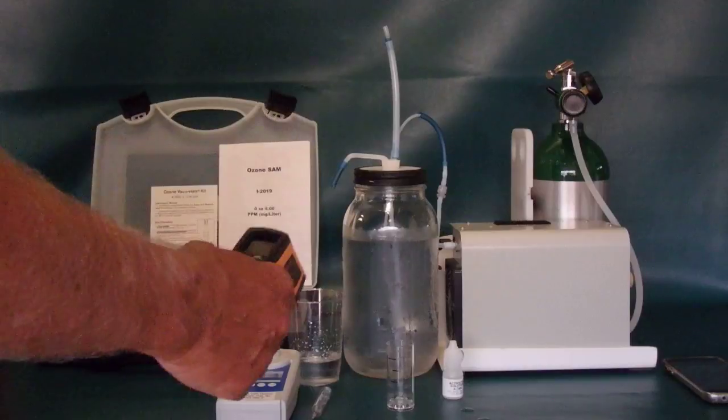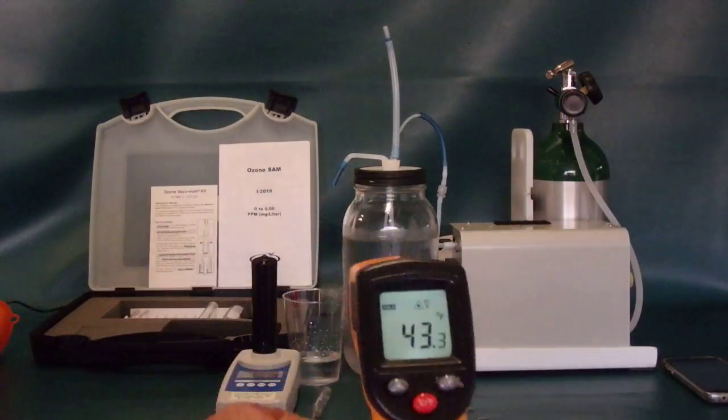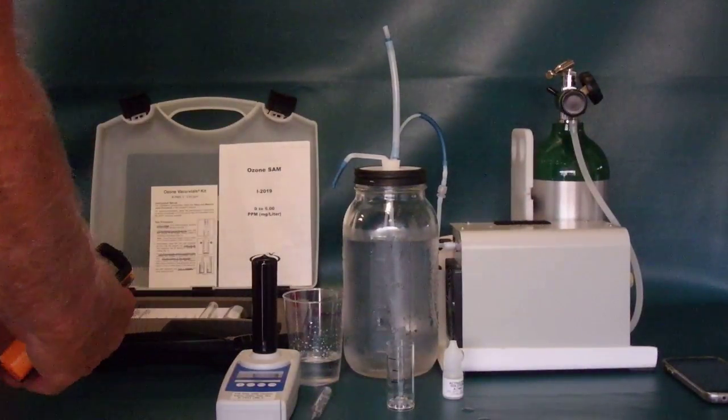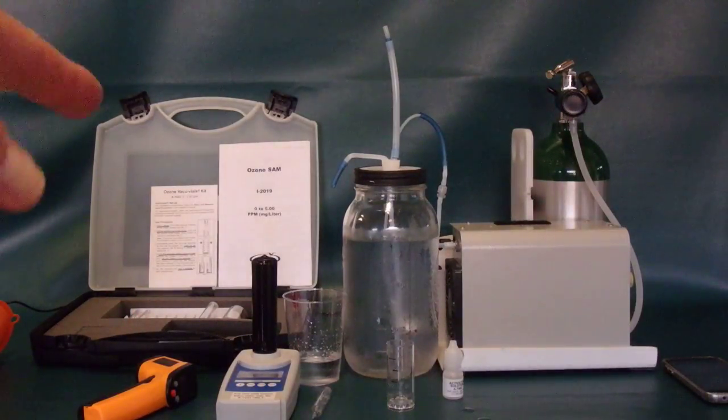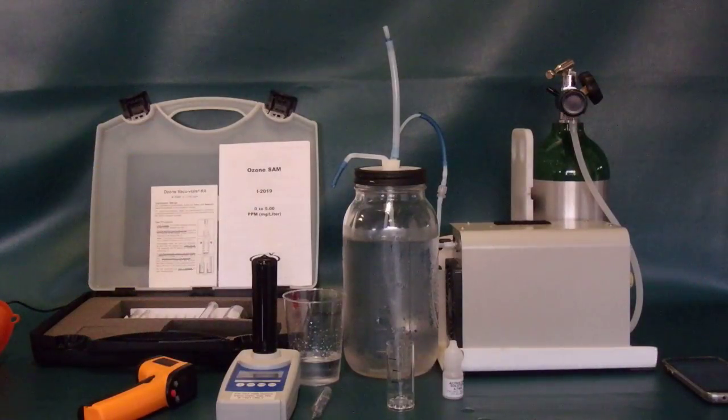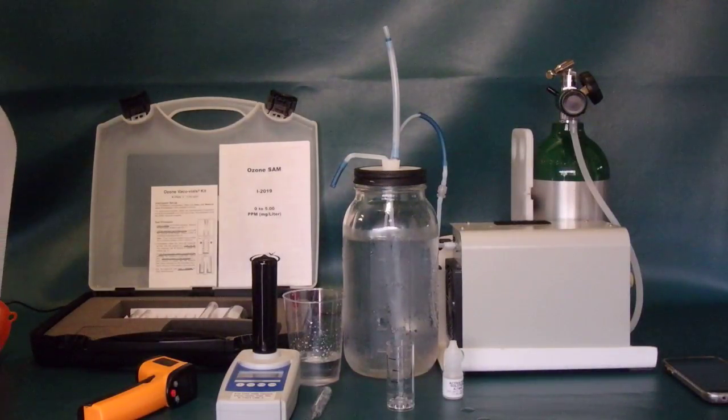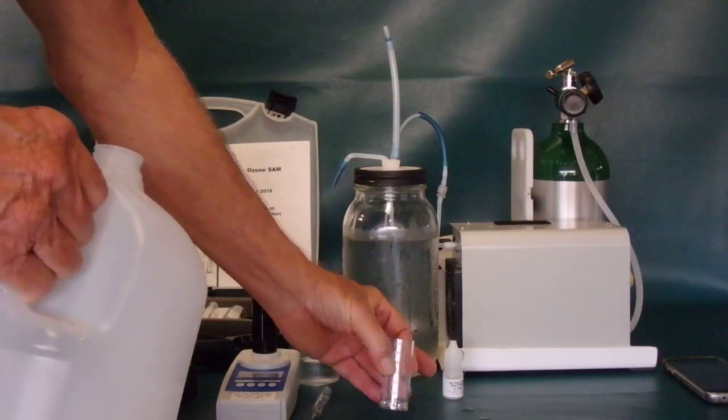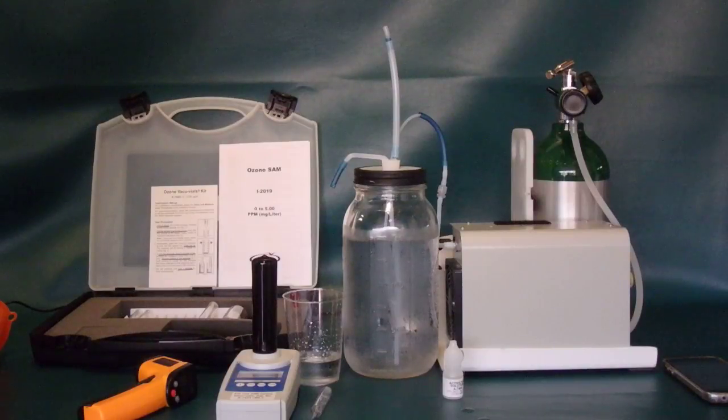We're now at three and a half minutes. And let's just check the temperature of the water. So it says it's 43.3 degrees Fahrenheit. We're now at four minutes. Another 30 seconds, we'll go ahead and load our distilled water in the vial there up to three-quarters full.